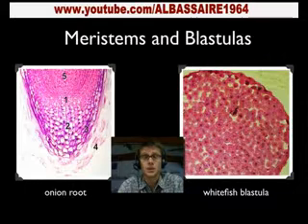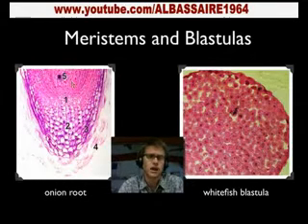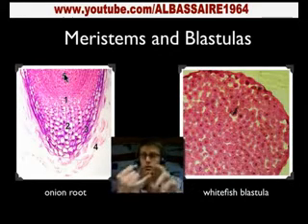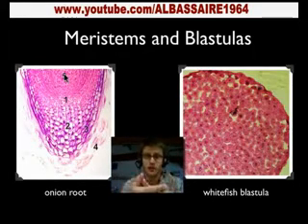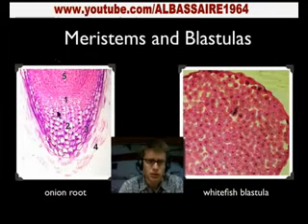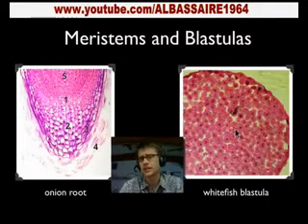Okay, so let's start with the mitosis side. And we do this in class. We could either look at onion roots in this case, or we could look at a whitefish blastula, but we're going to find similar ratios. In other words, we're going to find cells right at the bottom of a root that are actually dividing through mitosis. They're going through interphase, prophase, metaphase, anaphase, telophase, cytokinesis, and then that eventually, as they get larger, is going to push the root down through the ground. And so you can actually see this is a root cap on the top that actually protects it, but behind that we can actually see cells that are already in different phases. Or we could look at a blastula, which is essentially a baby whitefish, stem cells as they start to divide, which eventually is going to create that new fish.